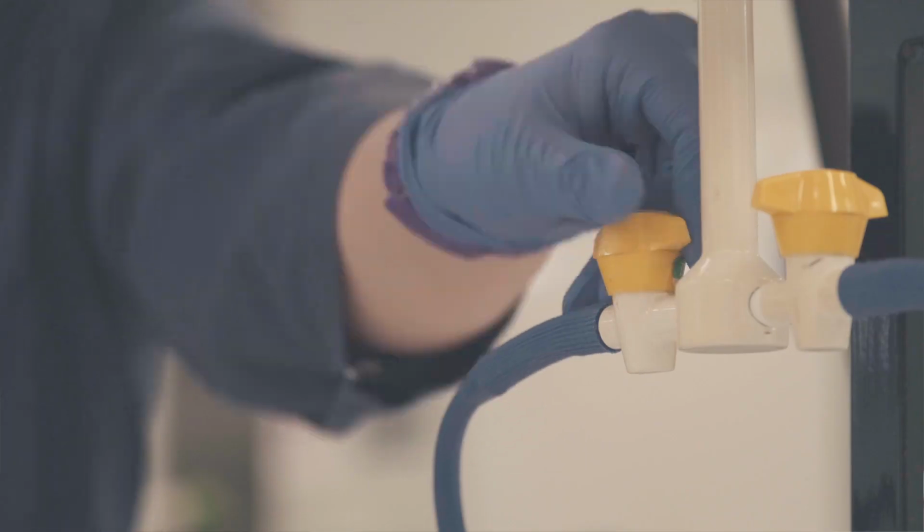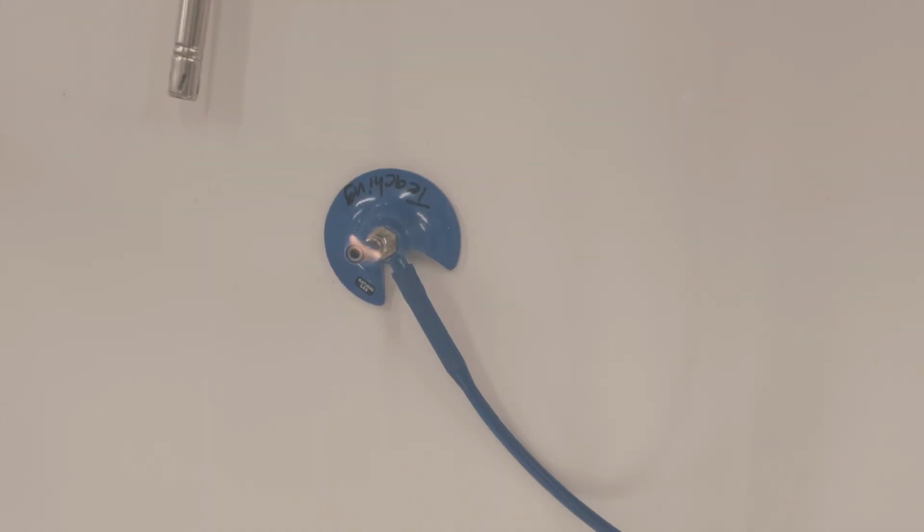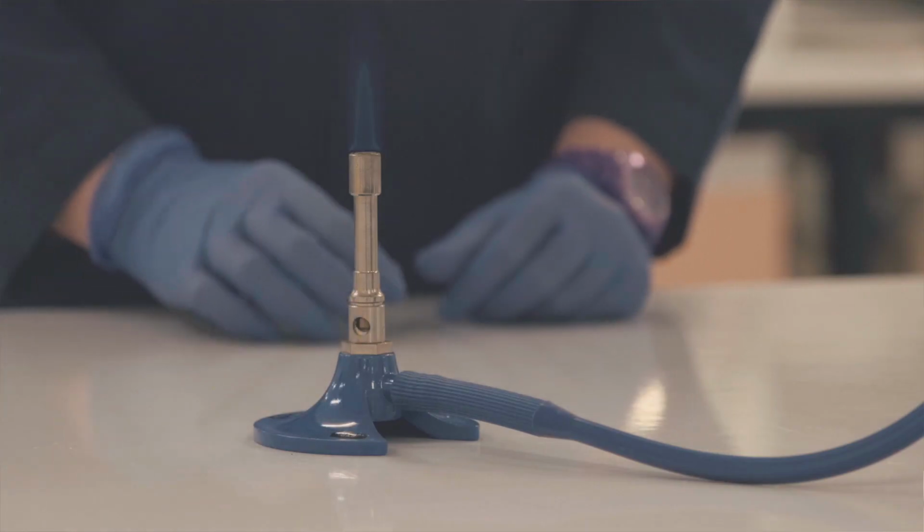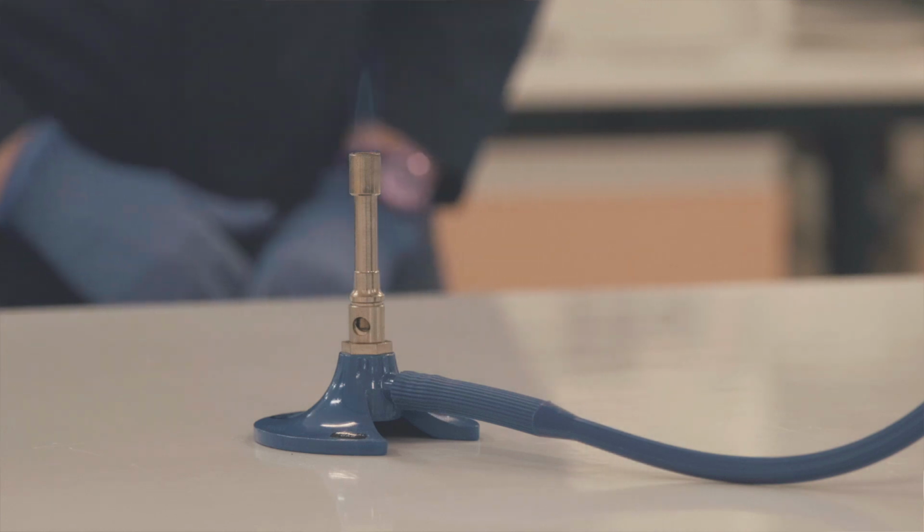Airflow can carry airborne contaminants, but we can deal with this in a few ways. You can light up a Bunsen burner and the updraft from the flame creates a relatively sterile area. There is an option to change the flame from orange to blue. The blue flame is much hotter and provides better sterility. The blue flame can be hard to see. Work as close to the flame as possible, but take care not to burn yourself.